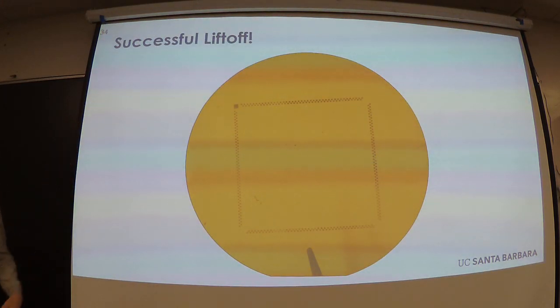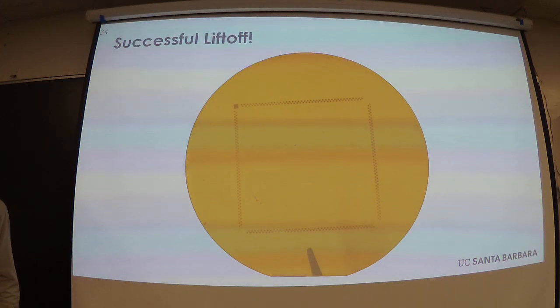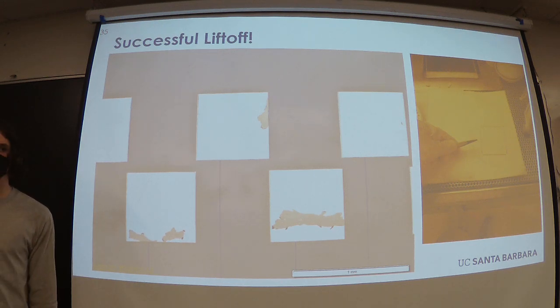And this is what the successful liftoff looked like, just a top-down view of the whole wafer after this. You can see that there are some flecks of gold, so it didn't entirely come off, but they're small enough that it's not going to cause problems when we go to image, and by and large, they aren't where the electrodes are, which is the important part where we don't want gold. There was some delamination on the bond pads, but the actual wire bonding tip itself is very small. You'll see in later pictures. So the fact that these bond pads are mostly intact is definitely good enough for the thing we want to do.